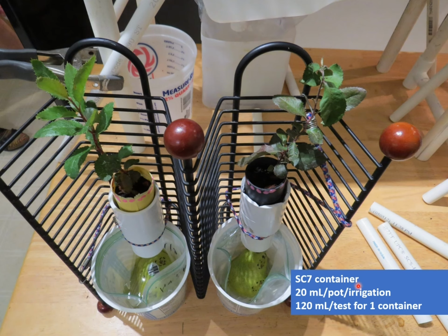These are SC7 containers. They only get 20 mils of irrigation per each event, and so for the whole test there's only 120 mils of leachate or less, and that's not enough even to float the pears, so the pears just sort of sit in the water there. And we have had detections under all those conditions, which is kind of interesting because we were looking at total volumes of water from 120 mils to 288 liters. That's a 2,400-fold difference from the smallest to the largest.